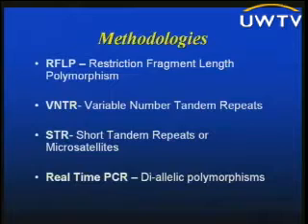Short tandem repeats, as I said, are a subset. They extend from a single nucleotide to 7 or 8 nucleotides. And that's what we work with in the lab, and so that's what I'm going to be focusing on. And finally, I'll give you a little overview on this new test that is currently being developed by Celera.